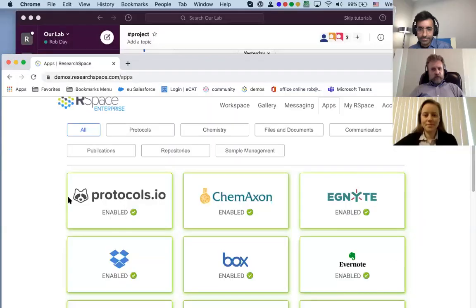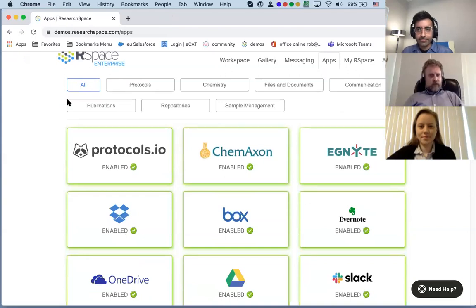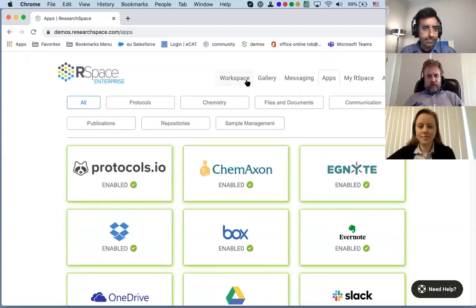Okay, great. And the next question is, if you export a PDF from RSpace, does the protocol also show up there? It's kind of a two-part question: how does it work when you reference the protocol, and if you add the reference for versions, do they both appear? That is a fabulous question. Once again, I'll share my screen, that's the easiest way to show that. The short answer is yes and yes. In fact, the answer to almost any question involving RSpace is usually yes.